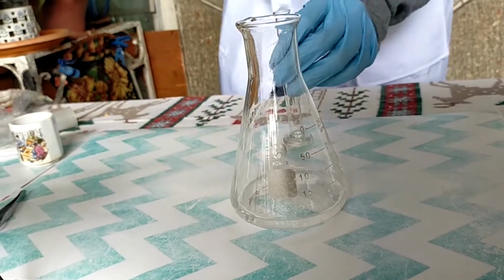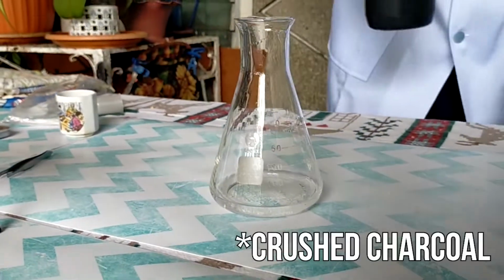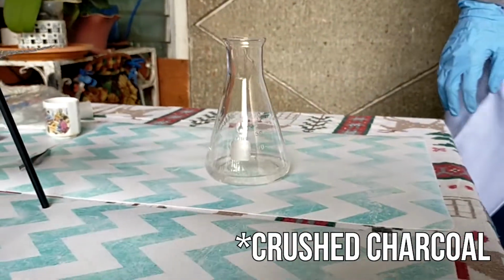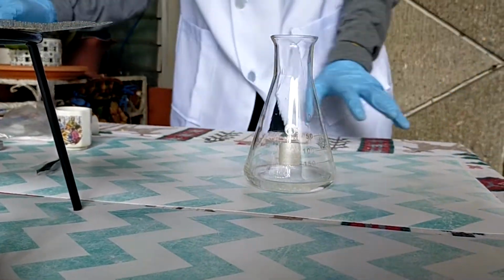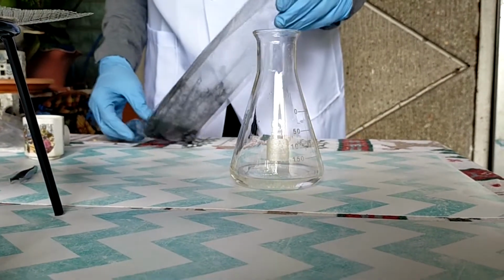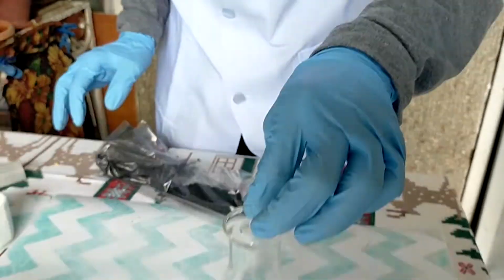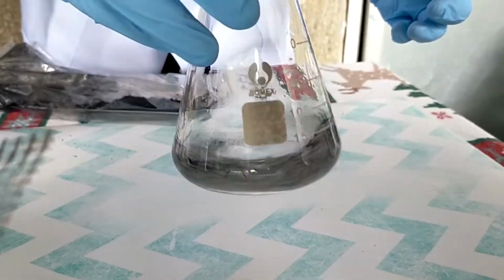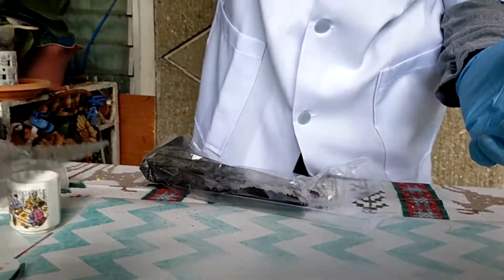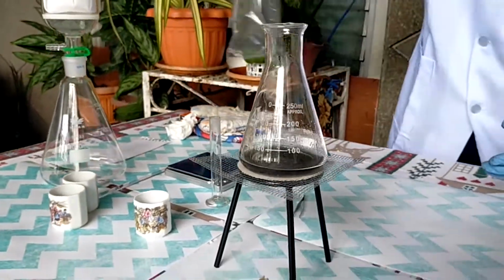We will add a pinch of activated charcoal, and we will heat here. There's some charcoal. We'll just add a pinch of this. That's our charcoal. I'm gonna slosh it, and then we're going to heat it.